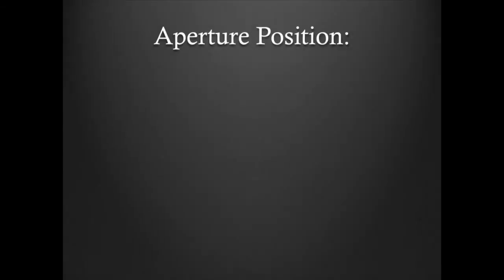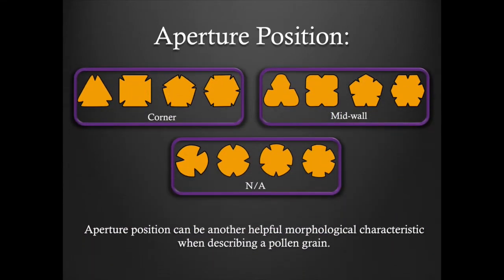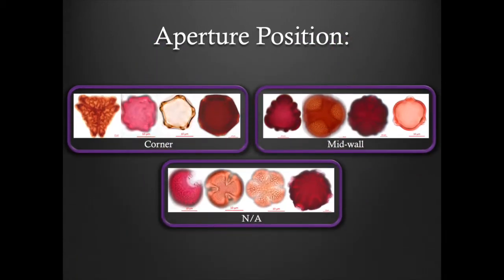Aperture position. Once you are able to determine a grain's orientation based on the presence of apertures, you can further morphologically describe your grain based on the position of the apertures when observed in the polar orientation. For angular grains, the apertures may lie on the corner of the grain, or they may fall mid-wall. For grains that are circular, elliptic, or lobate, this morphological characteristic would be considered NA, or not applicable. Please take a moment to look at some examples provided for each category.